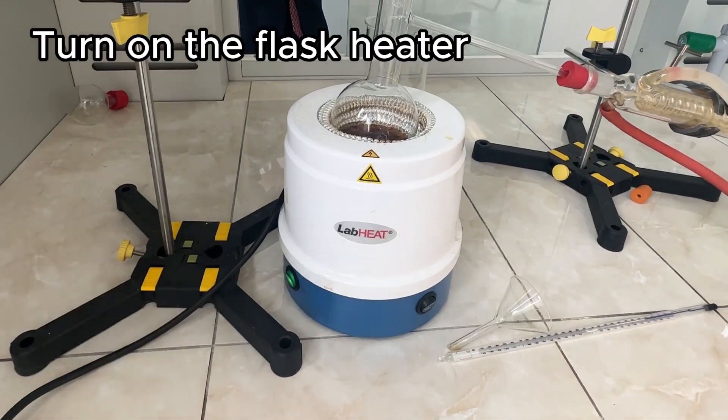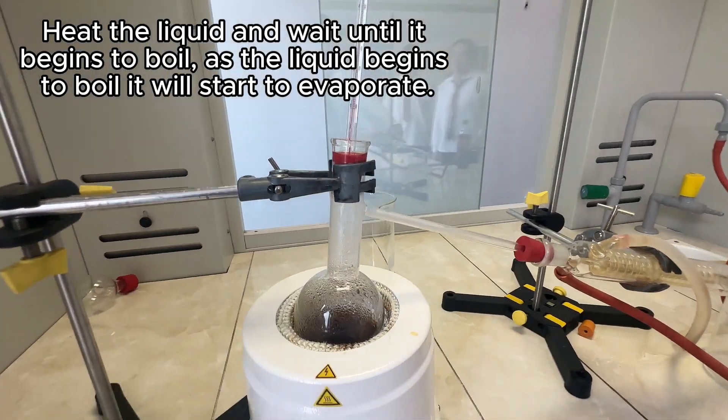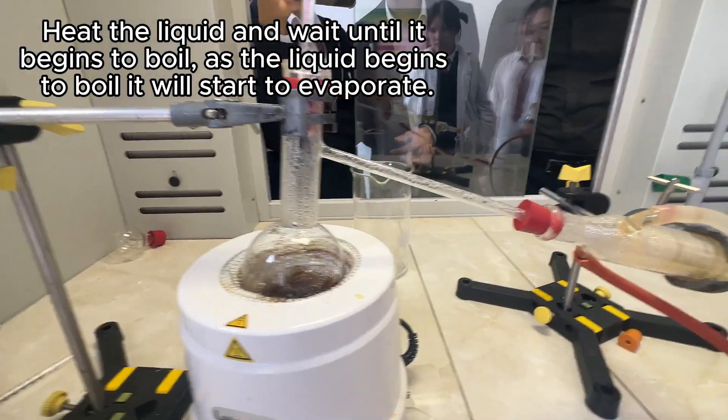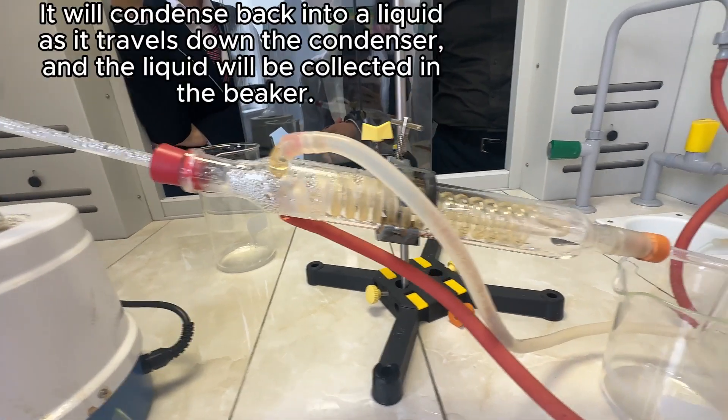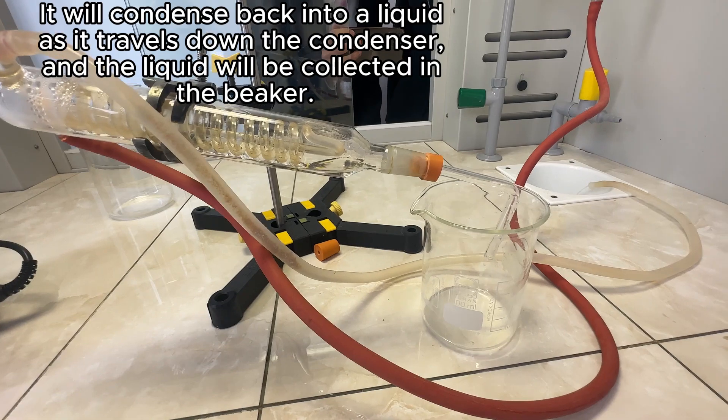Turn on the flask heater and heat the liquid gently and wait until it begins to boil. As the liquid begins to boil it will start to evaporate. It will condense back into a liquid as it travels down the condenser and the liquid will be collected in the beaker.